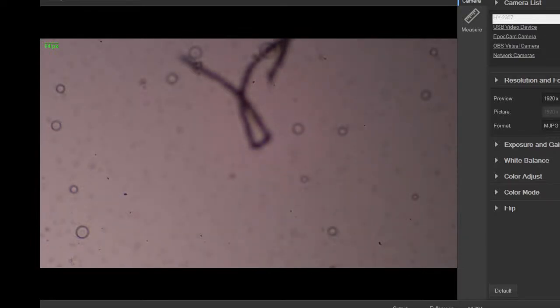And you can get a microscope that's $200. It will have some of those features, so that's not out of reach like it used to be. But this is a significantly more expensive scope, but not crazy. I definitely have to save up for a really nice one, like a differential interference contrast microscope, but those are about $5,000 starting price. But the image quality is unreal.